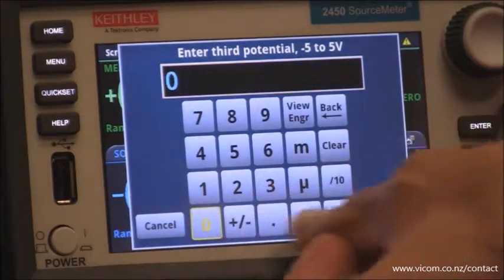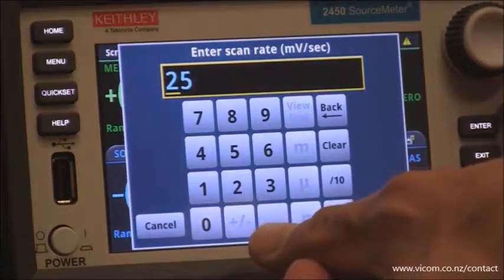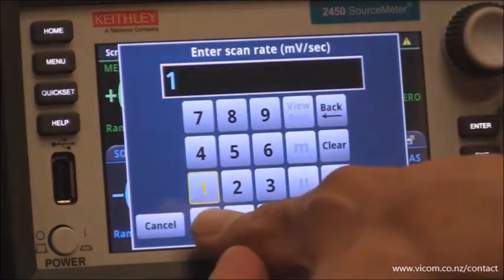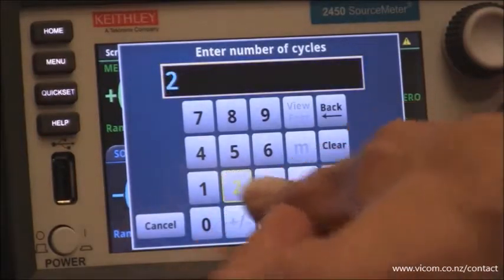And the third potential, we're going to go back to 0. For the scan rate, we're going to select 100 millivolts per second. The number of cycles, we're going to select 2.